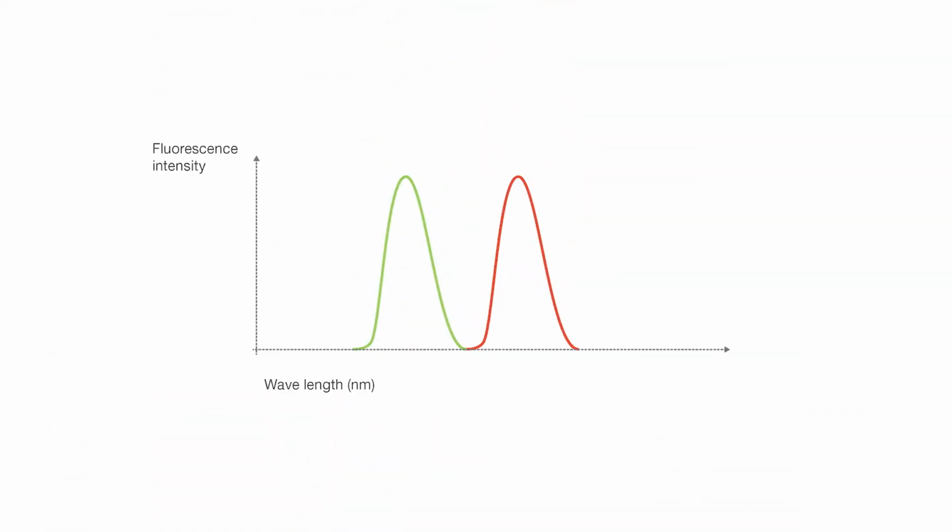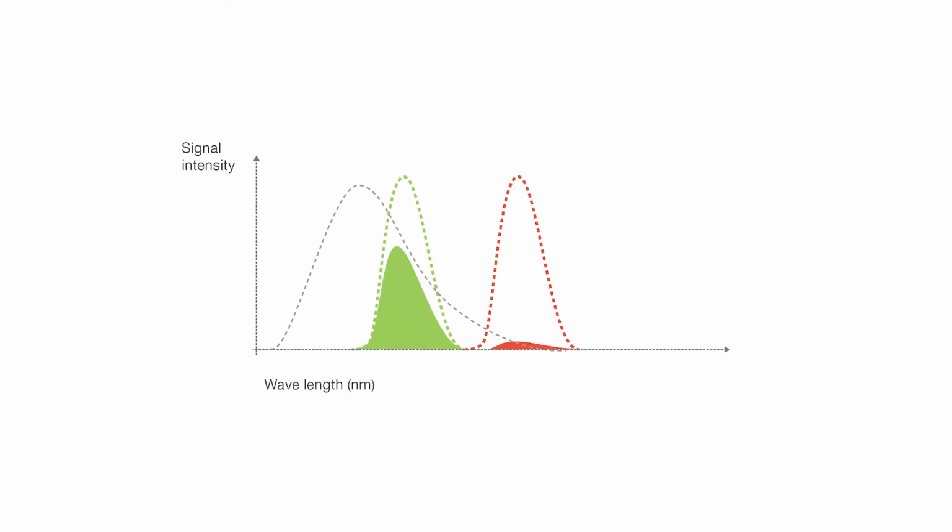To understand quantum efficiency, consider this example. The light intensities are the same for two different wavelengths. But if a camera has a quantum efficiency like this, then the detected signals will differ. Always check that your camera has enough quantum efficiency at the wavelength you need to observe.